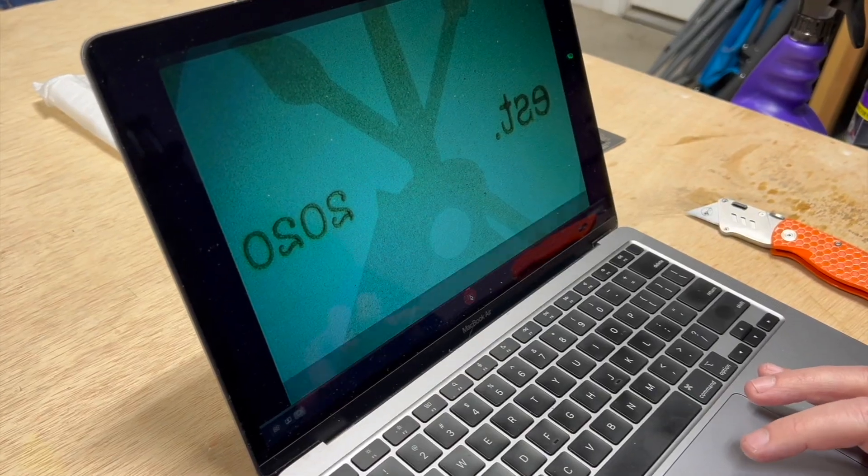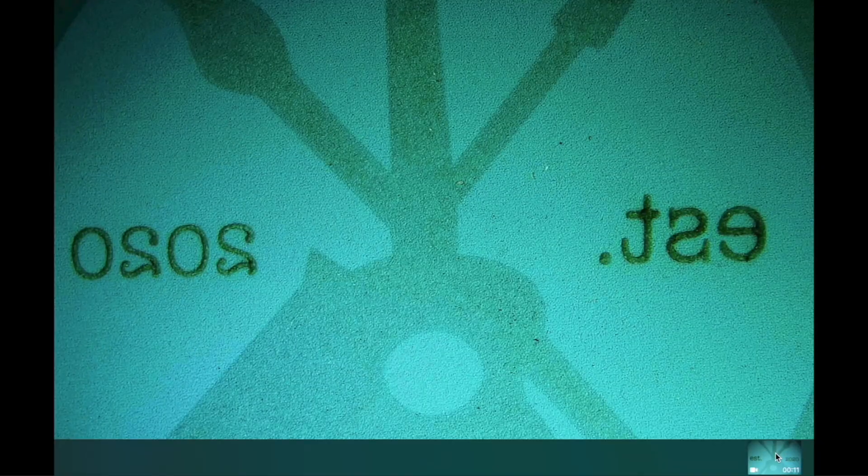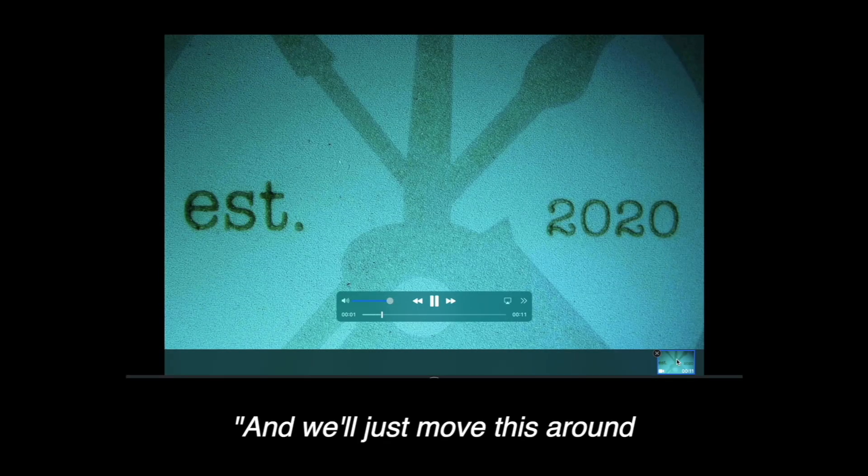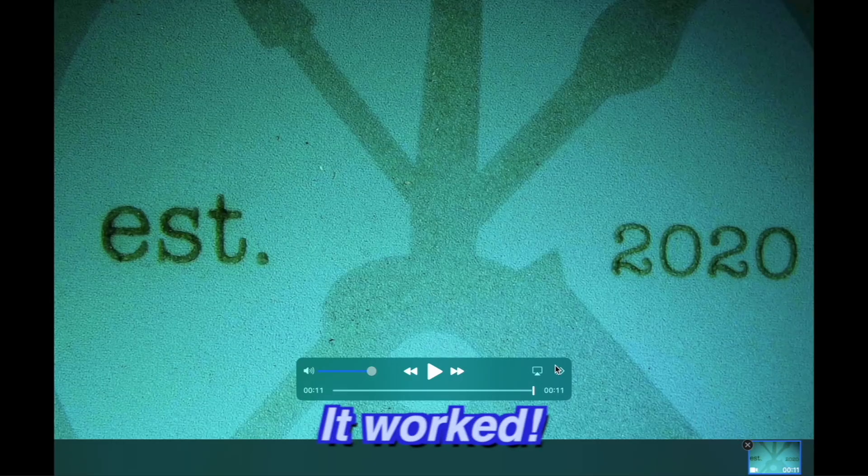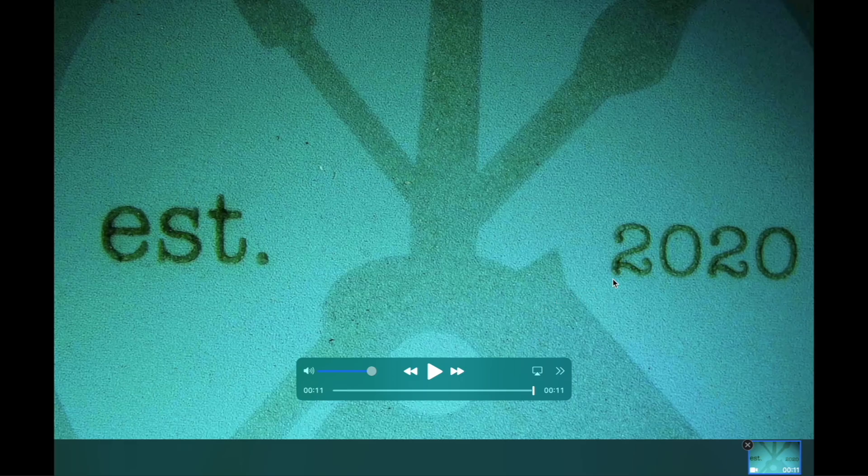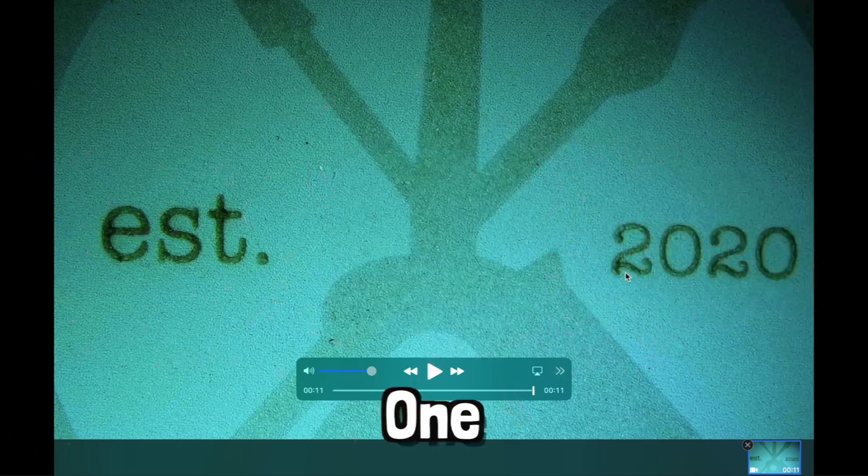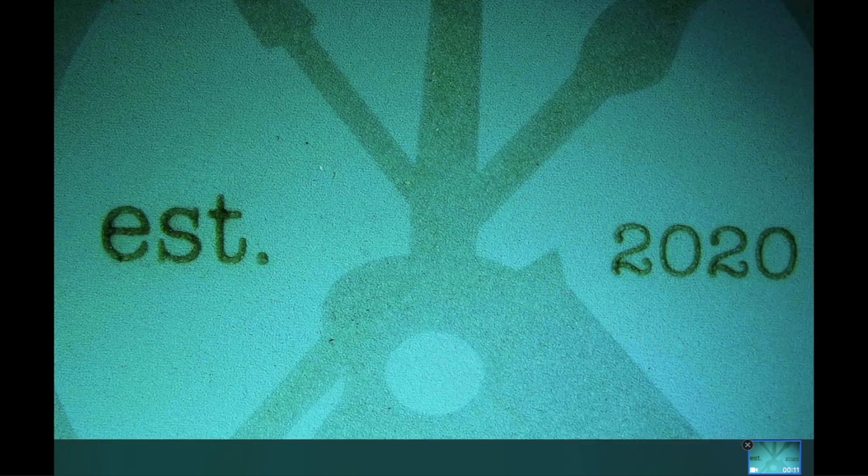And again it's because with this Photo Booth program it's using usually just the camera on the MacBook itself. So I'm going to go ahead and record this real quick and we'll just move this around just to show we're actually in video mode and see if this works. And I hit stop and there's our new recording. Let's watch that. Okay, so it worked. This is neat. So this does actually work with Mac. You just have to use the program Photo Booth, at least one program that you could use it with is Photo Booth, and it does seem to pick it up.